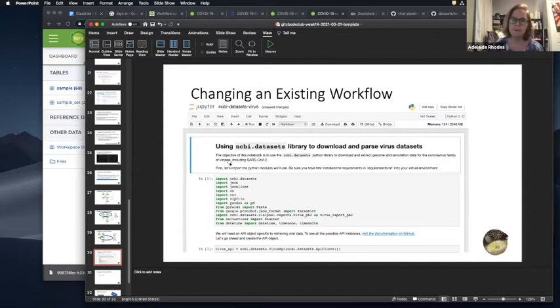You can imagine why that would be important if you can bring more of those into your workspace, because that would give you some more variability. If you are using the part where you align, you could test which reference seems to be working better, or whether you can make a pan reference, things like that. That would be cool to play around with too in such a virus workspace that harnesses the power of NCBI data.